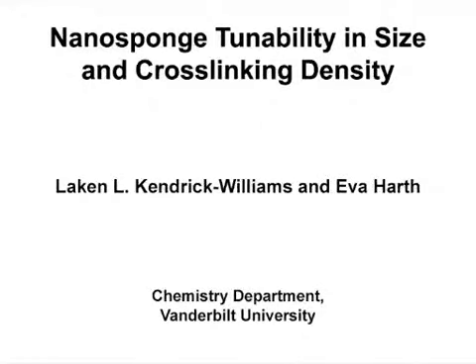The overall goal of this nanosponge synthesis technique is to understand and utilize important synthesis parameters for design and control of size and morphology. This method will help you to produce nanoparticles in precise dimensions and cross-linking densities for drug delivery applications. The main advantage of this technique is that it can be tailored towards different cross-linking densities of these particles and also towards different sizes of these particles.